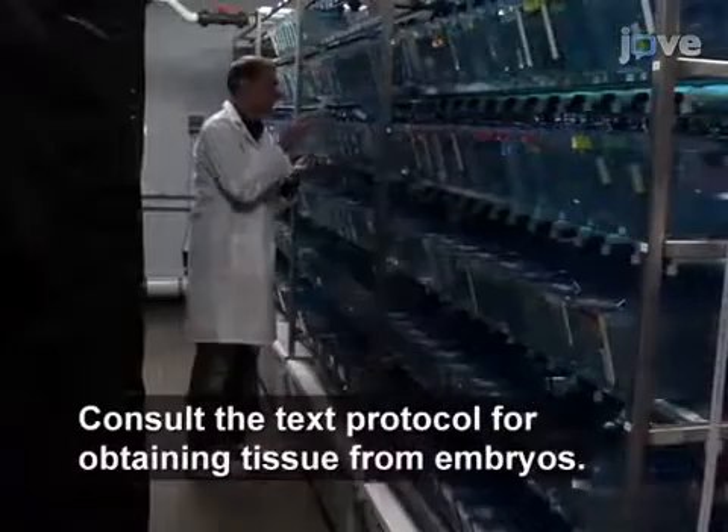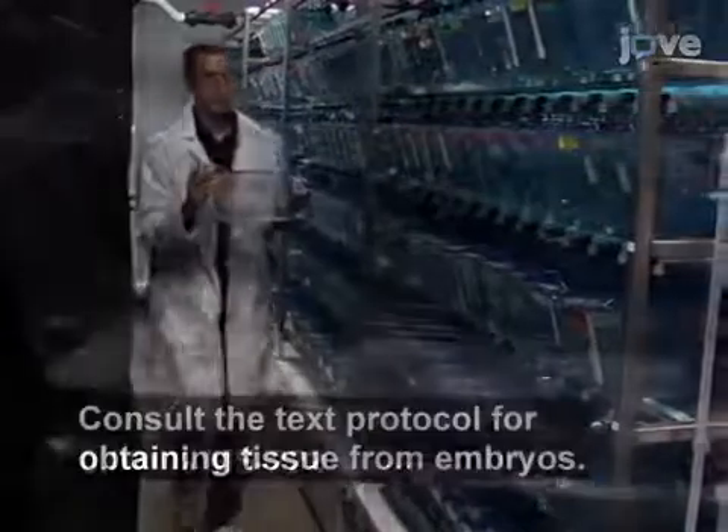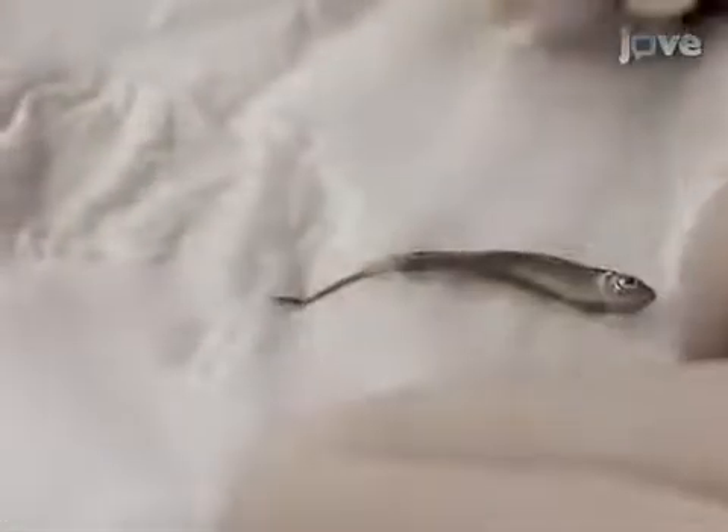Tissue can be collected from an adult fish using a fin clip or from an embryonic fish. First, anesthetize the fish in tricaine solution and wait until the gill movements slow. Then put the fish on a stack of tissues and, with a sterile razor blade, cut off a small piece of the tail fin, about 2-3 millimeters long.